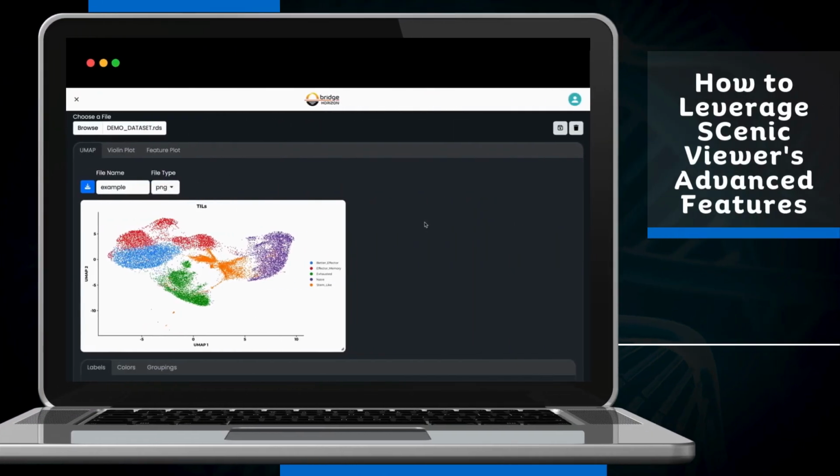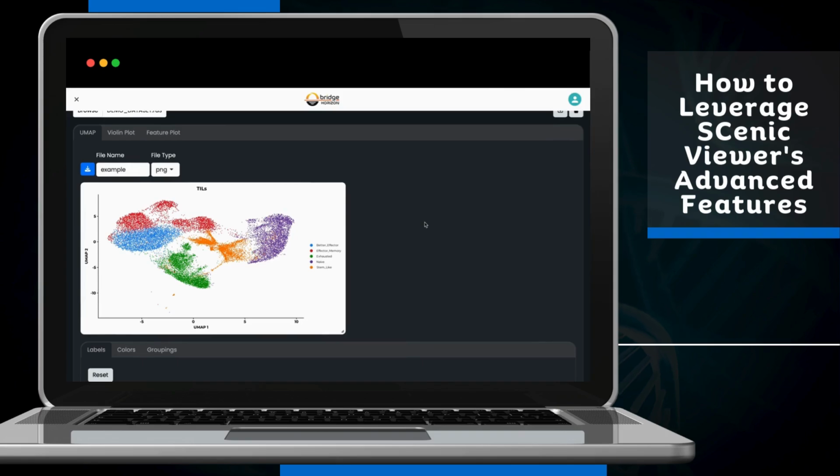In this video, we're going to discuss some of the more advanced features that are found within SCenic Viewer. So in my previous videos or tutorials, I walk you through how you can generate a UMAP plot, a violin plot, and then a feature plot in SCenic Viewer.